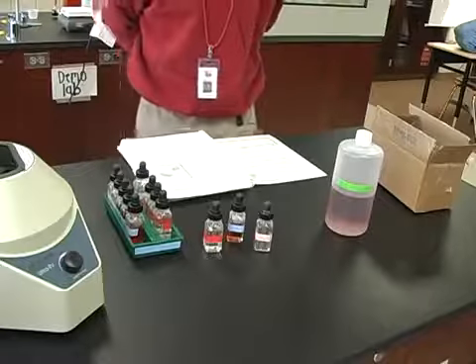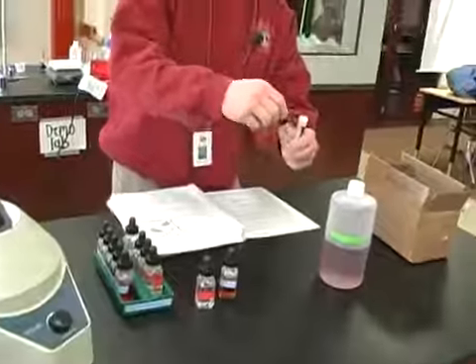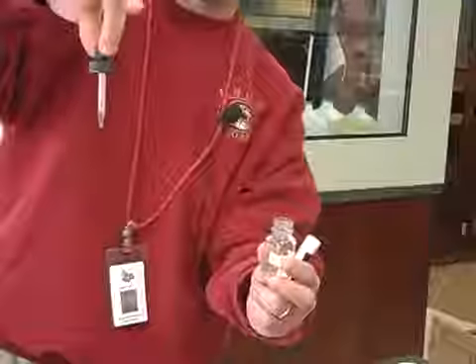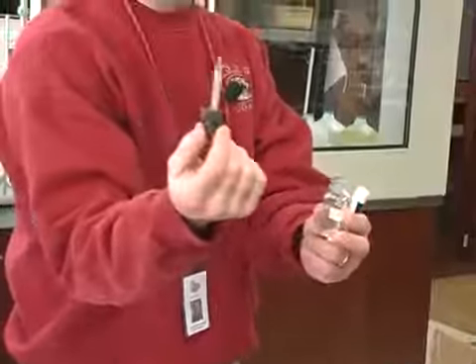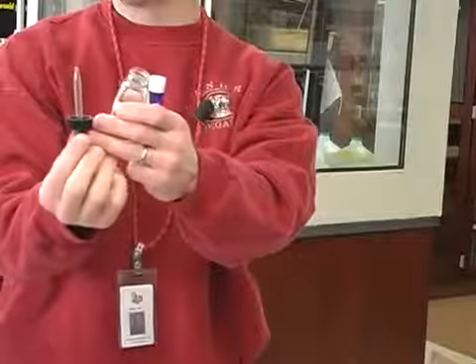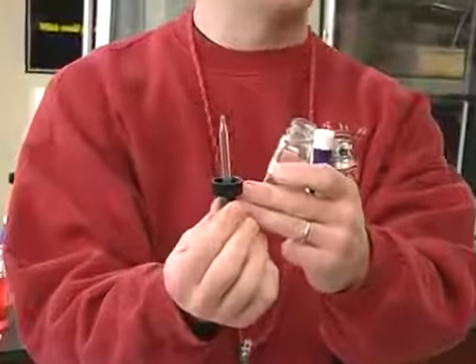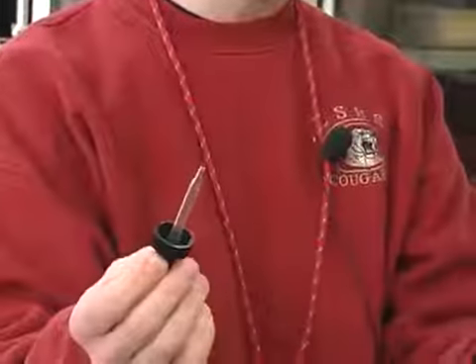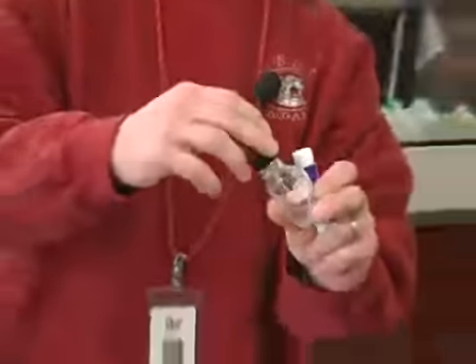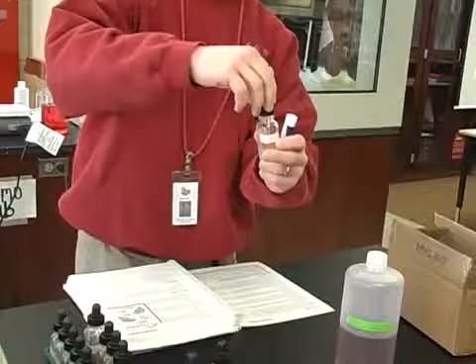When you use chemical reagents, do not turn the droppers upside down. So for instance, here's a dropper. Squeeze the dropper, get your solution out, and hold it this direction. Don't hold it like this thinking, oh, the solution won't come out, because then the solution goes into the rubber part of the dropper, and then some of the solutions will actually react with that. Now you don't have your solution anymore, you have rubberized solution or whatever it is. So make sure that you just hold them up like this and then do the dropping.